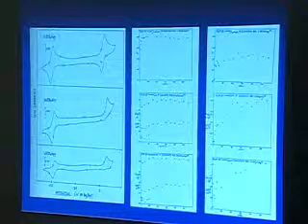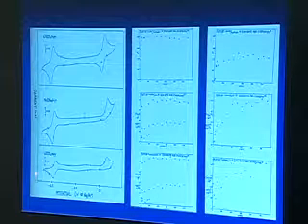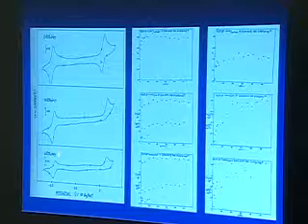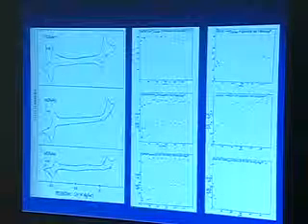So what we have here are cyclic voltammograms. This one is the chromium tetracarbonyl bipyridine complex, the molybdenum, and the tungsten. So we were looking at the data for this one down here. And what you can see, this is only at one scan rate, 100 millivolts a second, is that there, one might guess, is a reversible reduction over here, followed by a reoxidation. We're starting in the middle here.